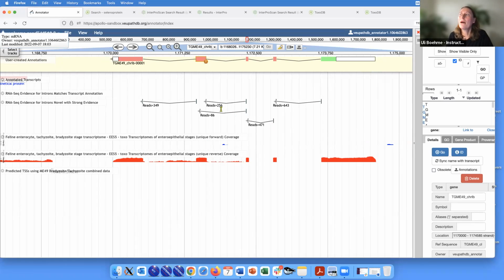Yeah. So they've answered that these question marks, indeed, are happening in Apollo, and unknown amino acids. Omar, you're muted. Yeah, sorry. What is an unknown amino acid in this case? So if it's a gap, referring to if there are Ns. Oh, I see. So the question mark is in the amino acid or peptide world, whereas the Ns are in the nucleotide world. Wherever there are Ns, the question mark is where the amino acid is uncalled, basically.